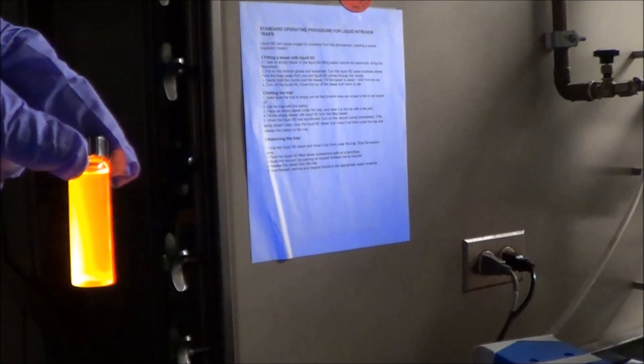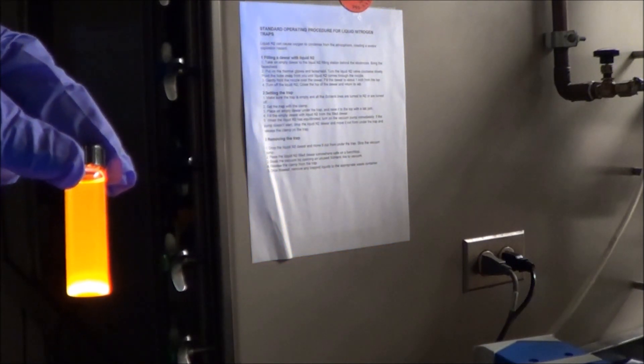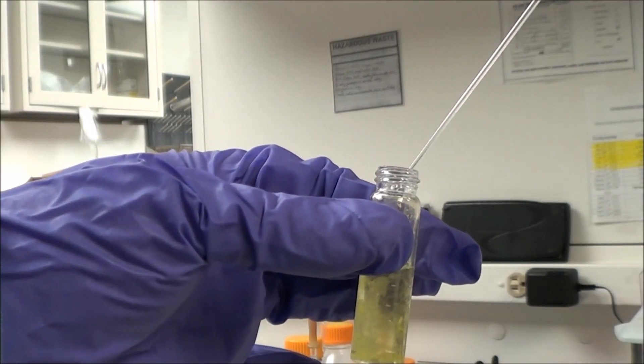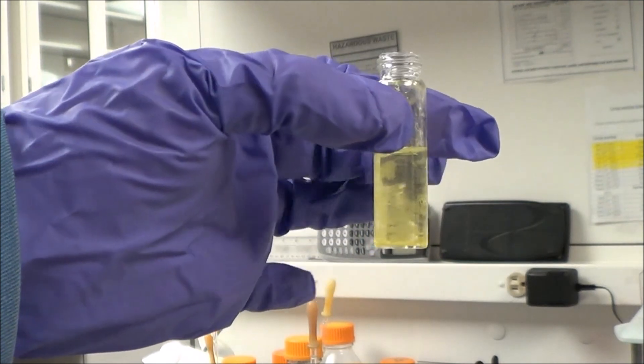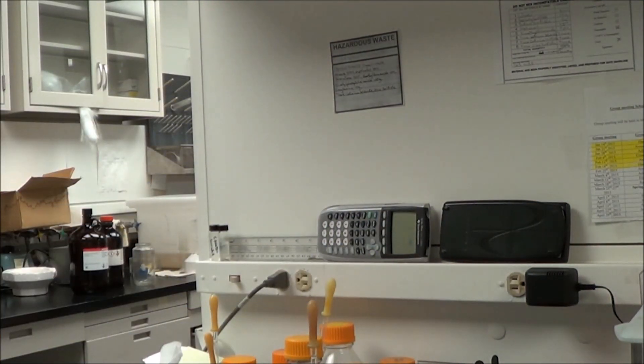Now the only thing is that the solution is quite caustic and has lots of excess polymer, so it's going to have to undergo dialysis. Here's the cadmium sulfide, and we've added some basic water, and you can see that the polymer is a little slow to dissolve, and that's actually why you have to add some strong base at the very beginning.